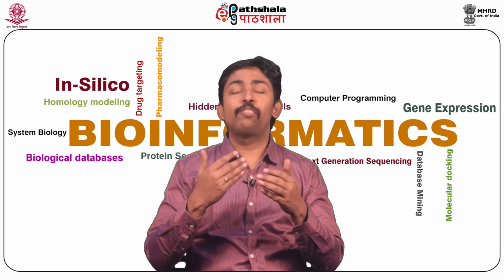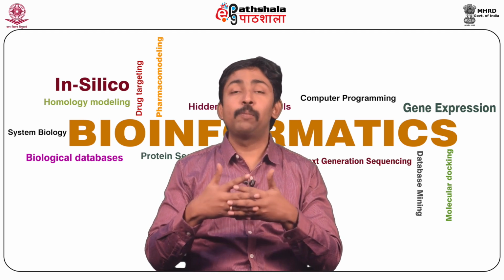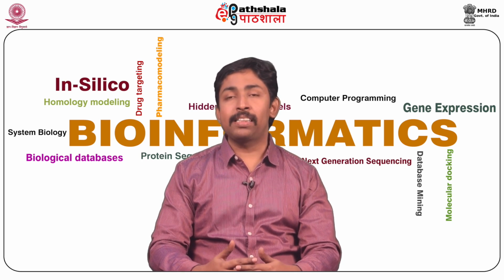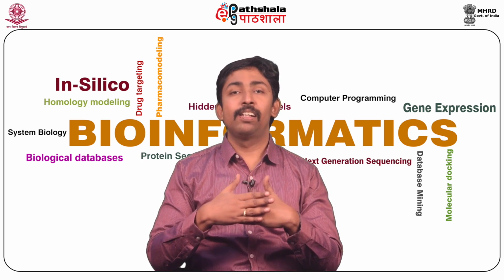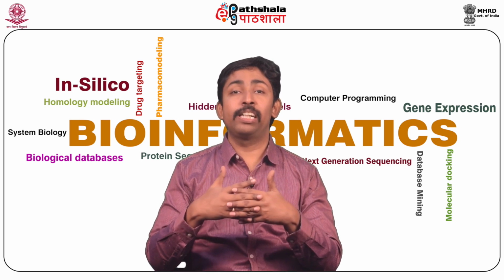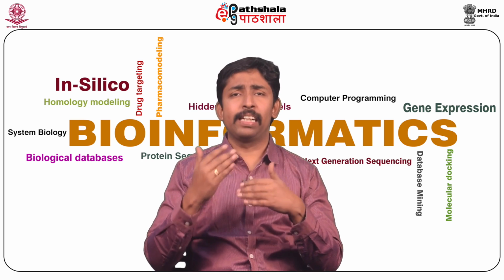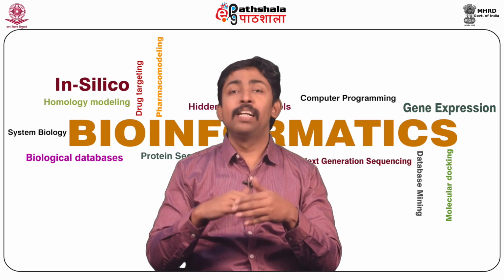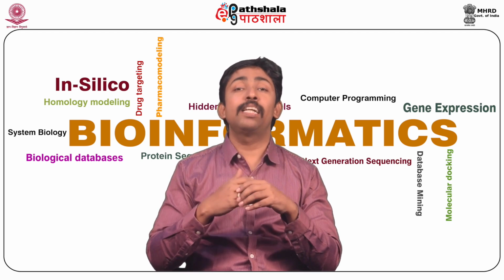So only few of the alignments will have a meaningful statistical score behind them to be considered as a significant alignment. So it is very important to parse a BLAST output and take only those data that we require. An XML output is more stable and is much easier to parse. So what we can do is have the BLAST output in an XML format, and then that could be used in BioPython, which makes it much easier to parse the data.